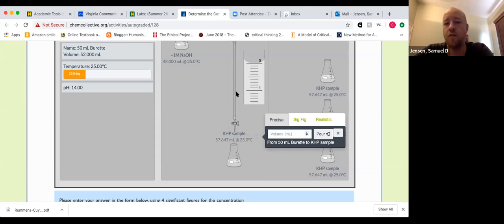Okay, so again, this first sample, you notice I have 4 samples. This first one is just a throwaway. I want to know about when it's going to turn pink. I don't even know what this is going to look like in the simulator. I've never used this simulator before, or presumably you haven't. I've done it before, but you haven't. So we don't know what we're looking at. What is this going to look like when I start adding stuff?